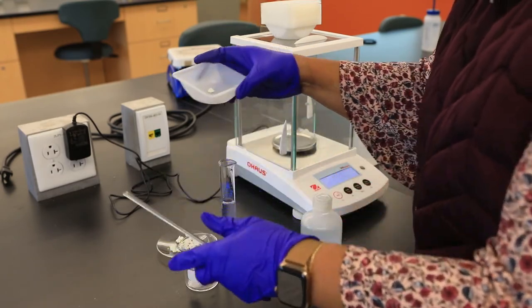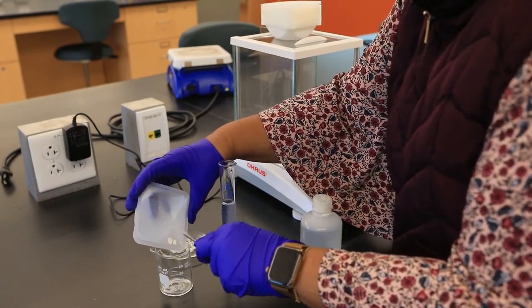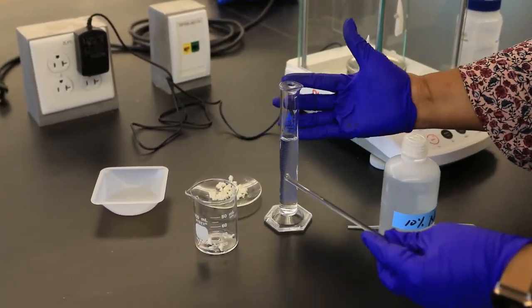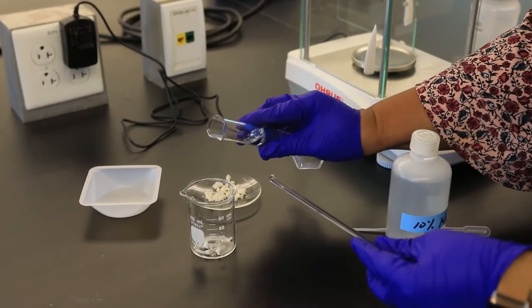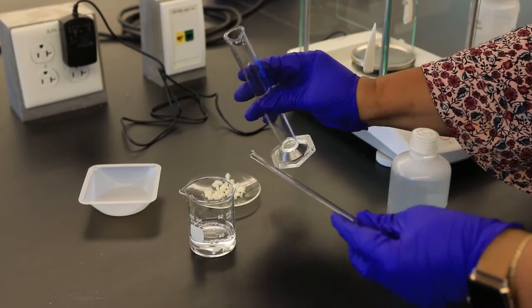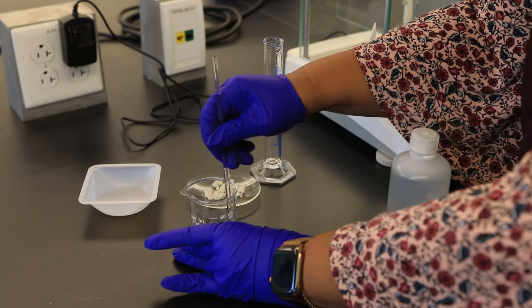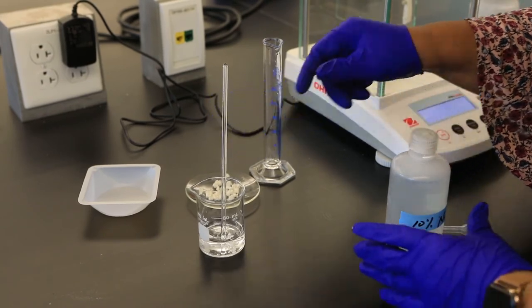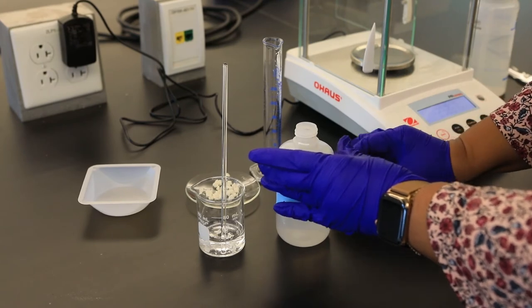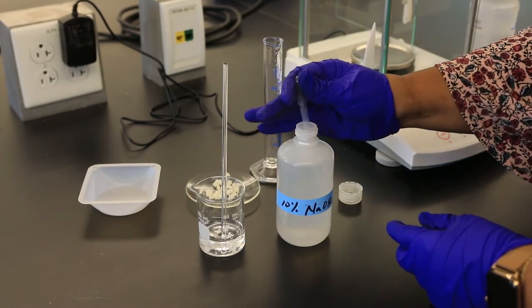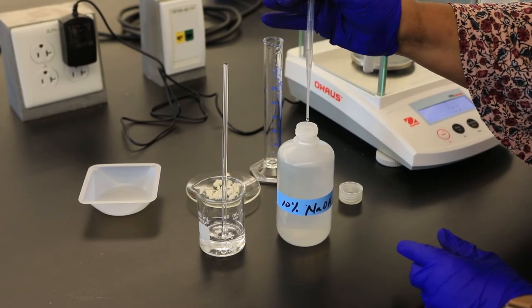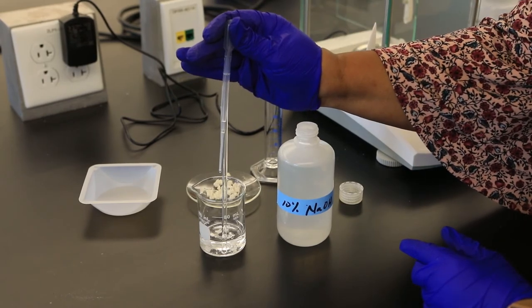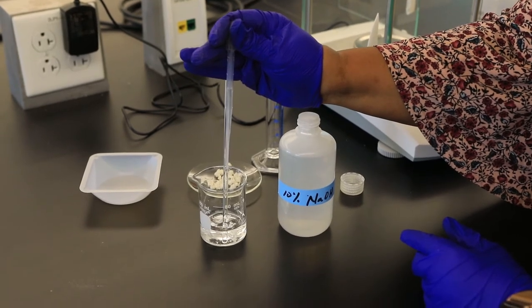I'm going to transfer the solid to our beaker. In order to do any testing on the casein, we need to make sure it's in solution. I'm going to dissolve our casein in 25 milliliters of water. To help ensure this solid completely dissolves, I'm also going to add 5 drops of sodium hydroxide - a 10% solution by mass volume percent. I'm going to carefully measure out 5 drops: 1, 2, 3, 4, 5.